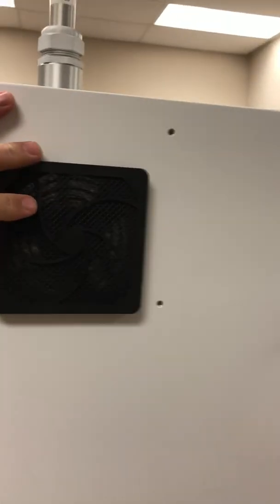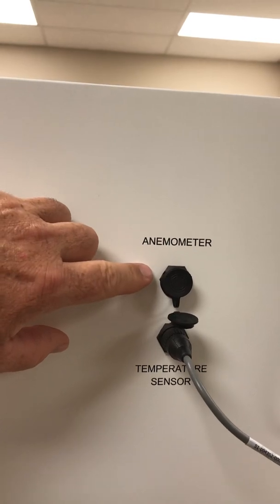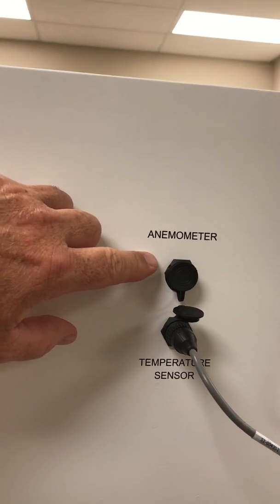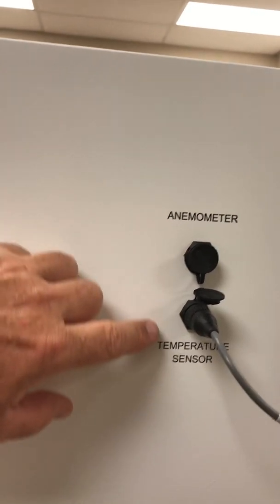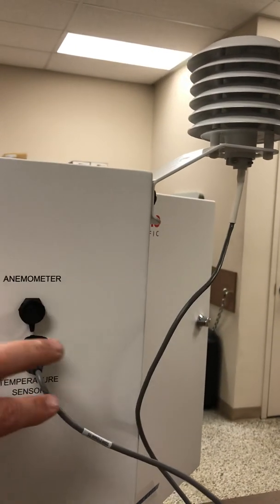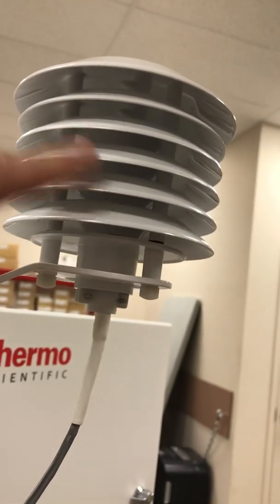There are carrying handles, and another fan on the back. There are a couple of options here — you can have an anemometer for wind speed and wind direction, mostly wind direction, so you can have the unit triggered depending on which way the wind is blowing from and have it turn on the sampler. That's why it has the anemometer option — also just to monitor wind speed and wind direction. The temperature sensor is connected so it can measure ambient temperature to include with the filter data.